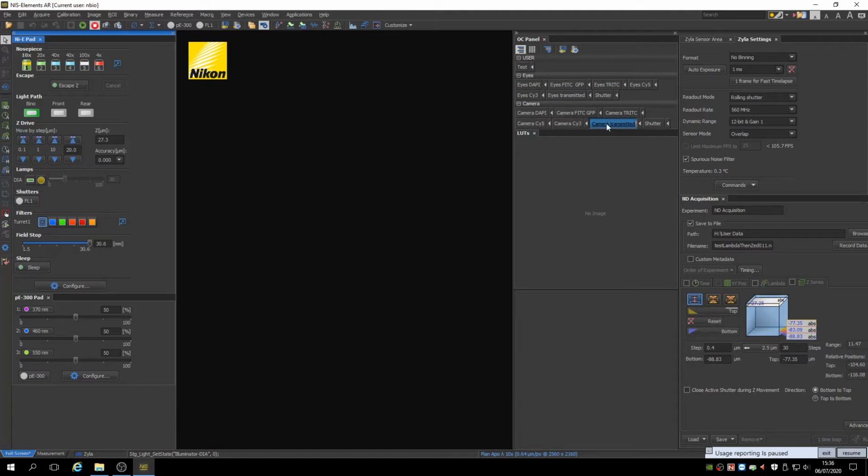So I'm going to start by looking for my sample with the transmitted light. So I'm going to click on here, and I'm going to go live.